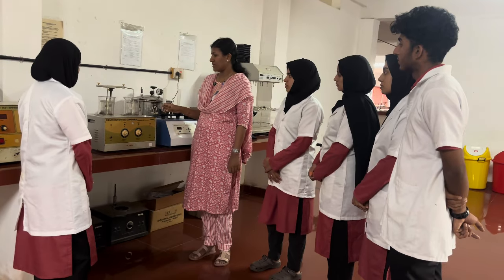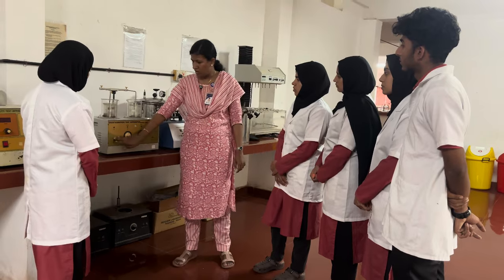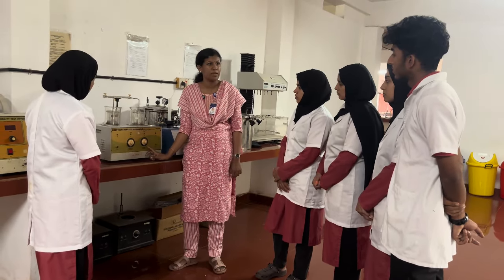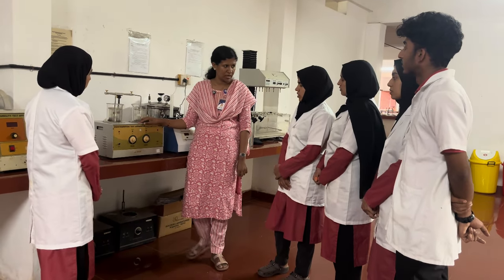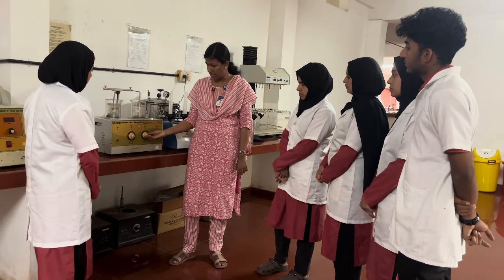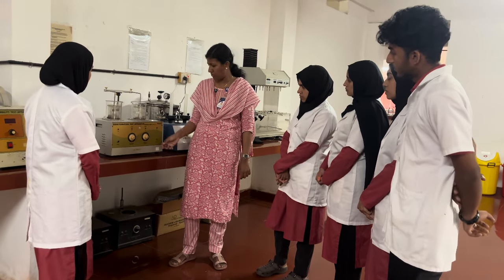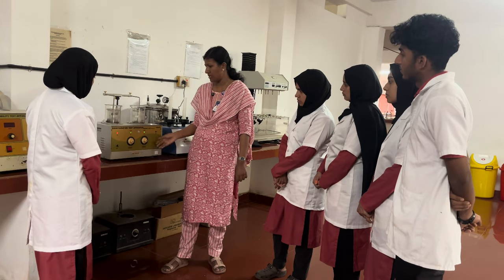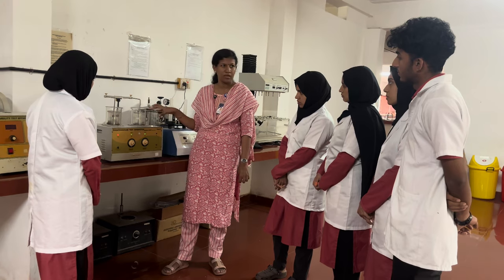Okay, what is the next step? We will switch on the equipment, we will switch on the mains. Before that, we have to adjust the temperature to the body temperature, that is 37 plus or minus 2 degrees Celsius. Next, we will switch on the mains and switch on the motor. I am just doing a sample. You have to do the filling of liquids and then place the tablets.